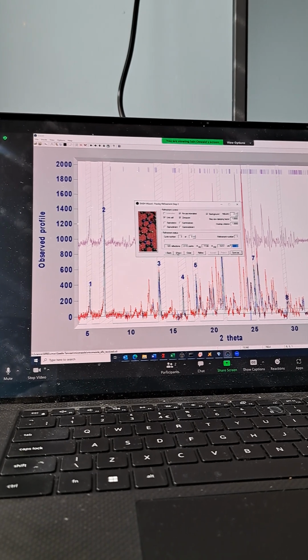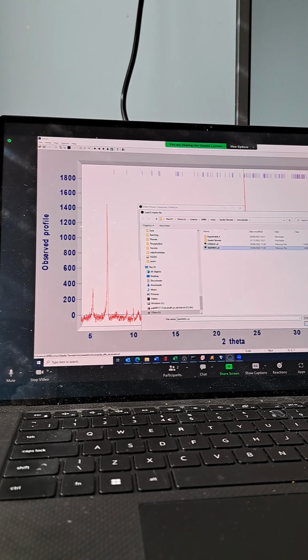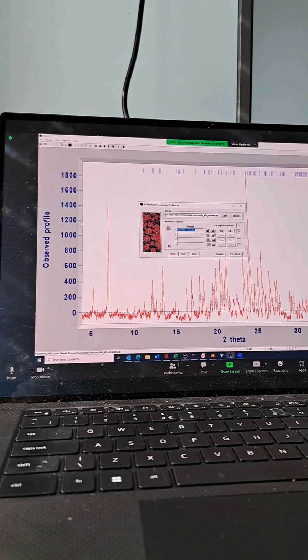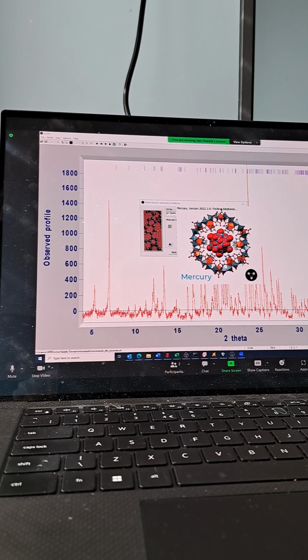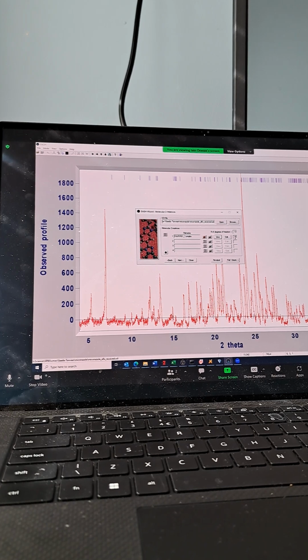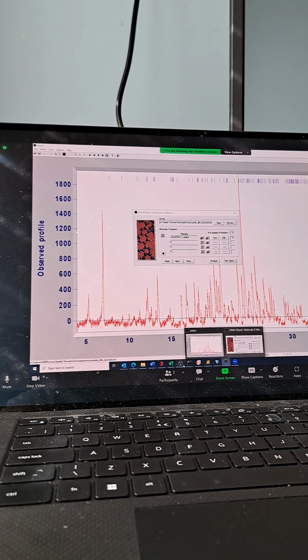But what we then do is go onto the solve button, and in here, this is where we're talking about putting in PAV-PIP, for example. Now, I put in my CIF file, and what it does is convert it to a Z-matrix, and I can view this in Mercury. So it allows me to see what the material is. Equally, it tells me how many degrees of freedom I've got. That's 12.